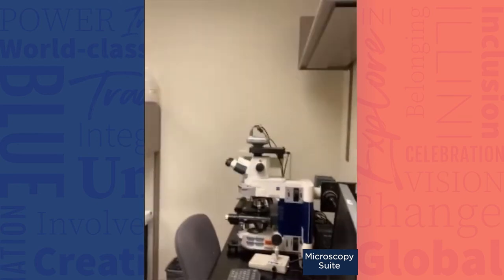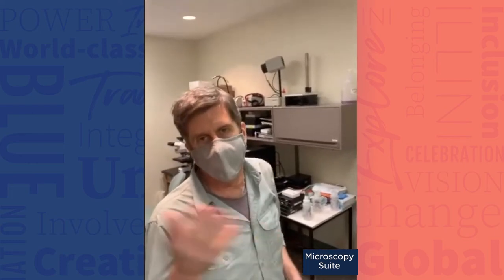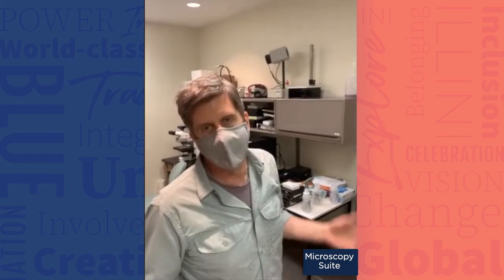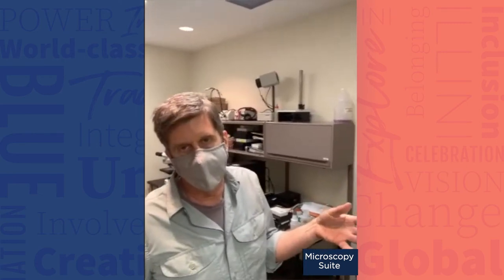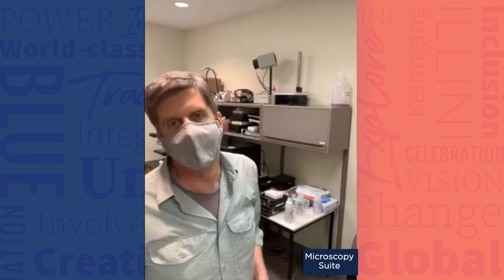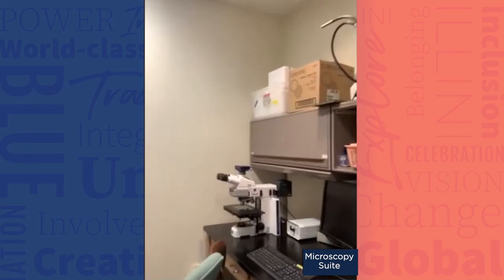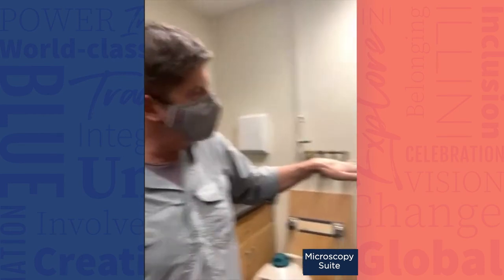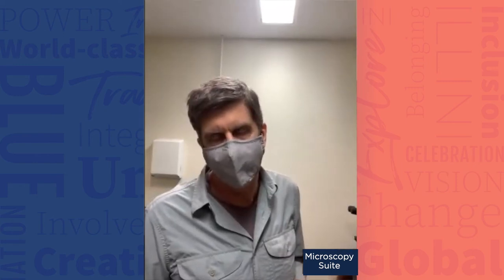This room is set up as a stereology workstation. We're counting slide after slide, cell after cell, brain after brain — looking at exposure to phthalates, bisphenol A, bisphenol S, and all these different kinds of things. It gets used a lot, so we're actually lucky we're not interrupting someone right now. The other microscope in here is one of our few upright microscopes; it has a really big stage, dark field optics, and also a cold stage and hot stage for light microscopy, which both conveniently fit on what we call an inspection microscope.